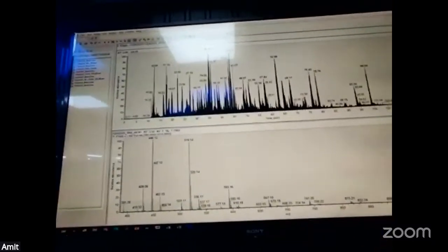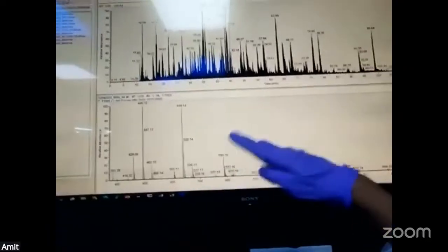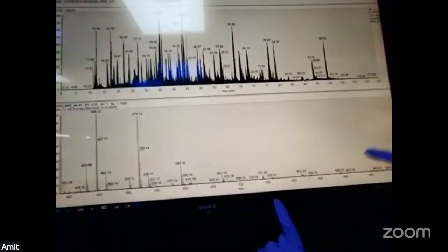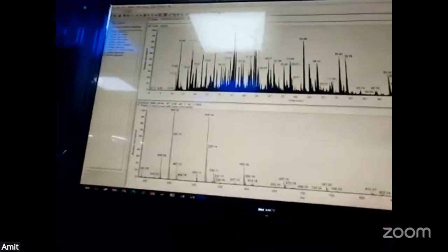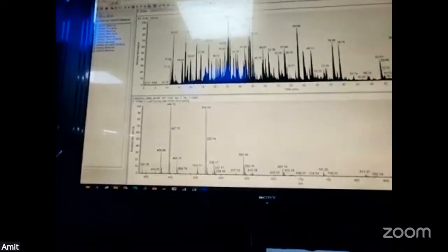Here we go from lower hydrophobicity to higher hydrophobicity, and the peptides are eluted at each phase. While the peptides are eluted, they go to the detector and we see the intensity, which is in the range of E9. The maximum intensity of the precursor is E9. But this is the total ion chromatogram of the MS1.